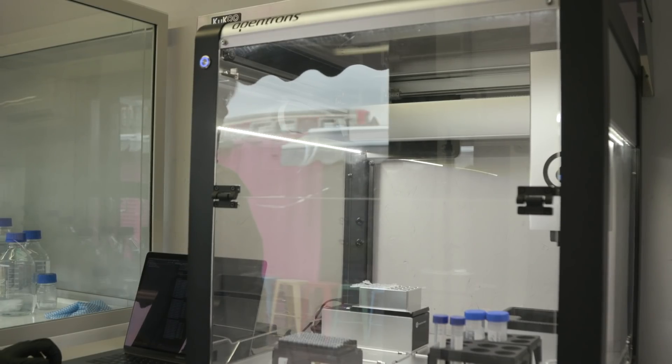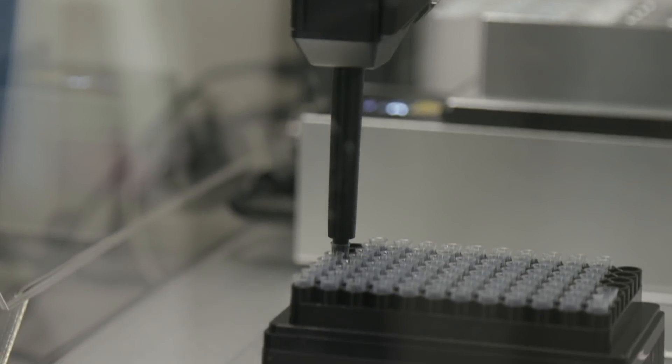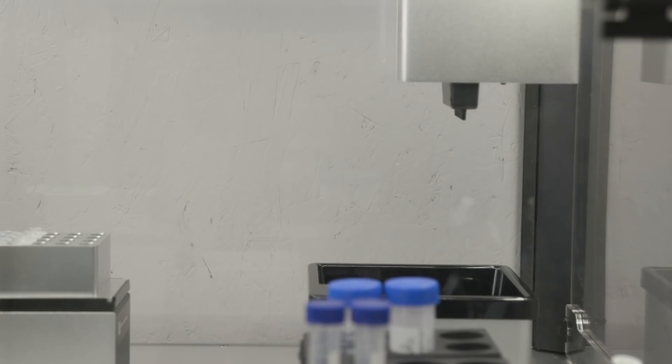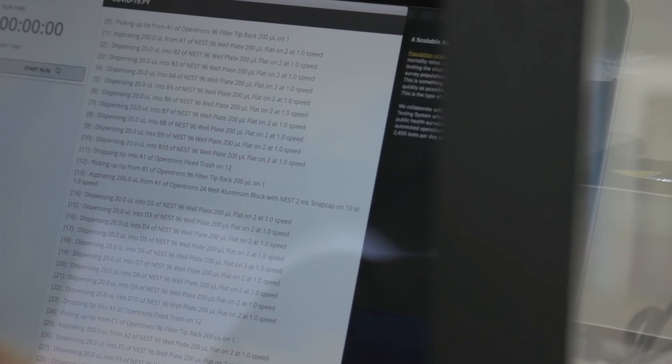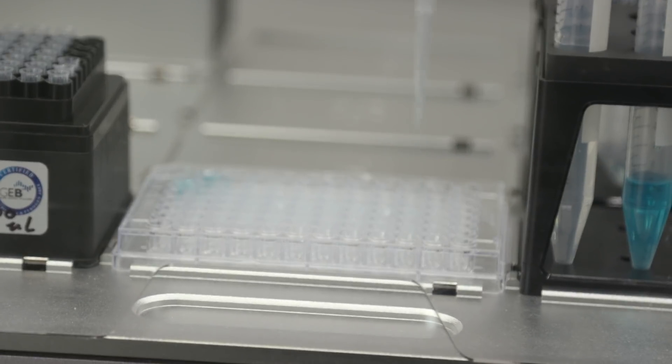U.S. company Opentrons donated two of its liquid-handling machines to the lab for their work. These plates can test up to 96 samples at a time. These are also PCR diagnostic tests, like the ones we saw with the other companies, but these are open-source rather than proprietary, and OpenCell says they would like to get the cost of testing down to £5 to £10 per test.